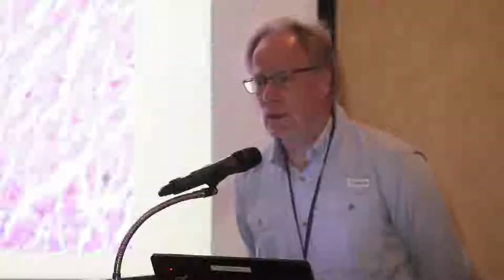Sometimes they're human tissue, most often they're cat. Biopsy the tissue, embed it in some sort of polystyrene resin. Don't use paraffin anymore. And I have them break glass knives, make the sections, mount the tissues, stain them, photograph them, label them, enhance them, what have you, and build up their own image bank. So they're usually given some sort of assignment. For example, compare muscle types in this cat cadaver, or look at the different types of cartilage and characterize each one. So that's kind of where this started.